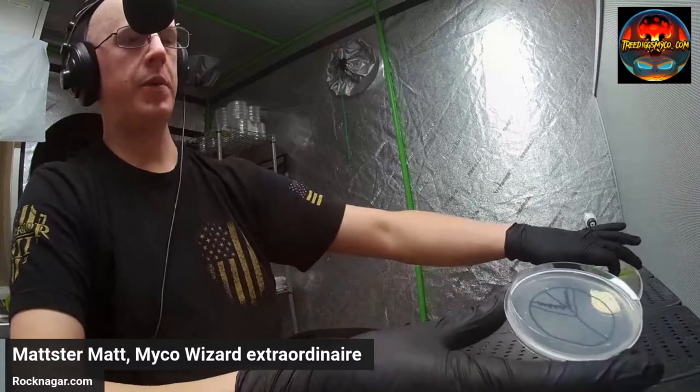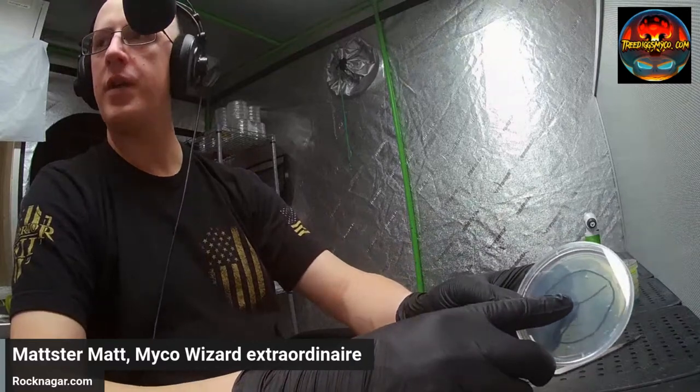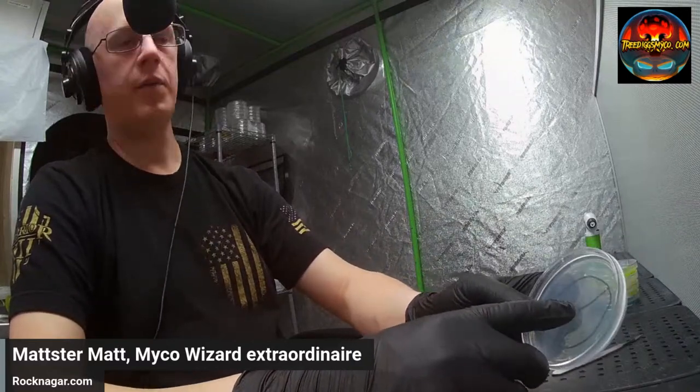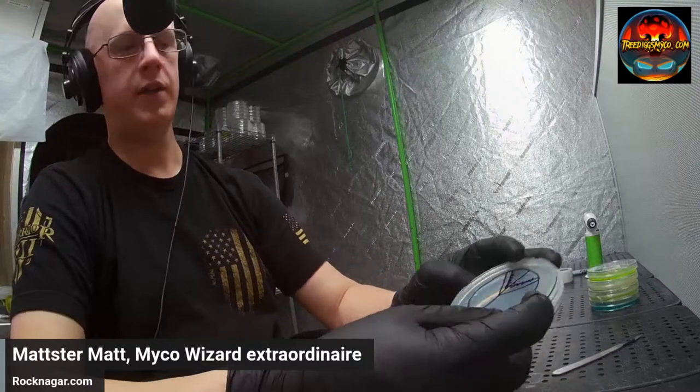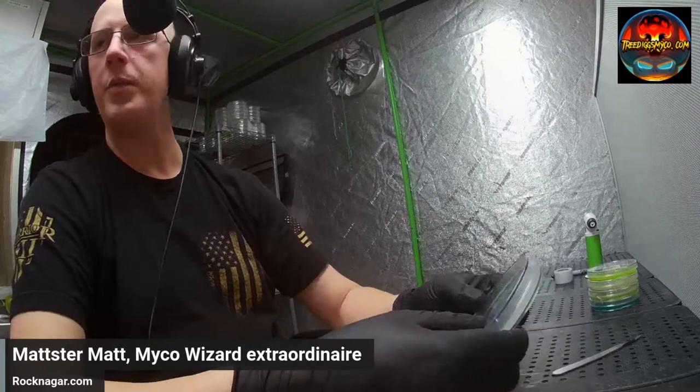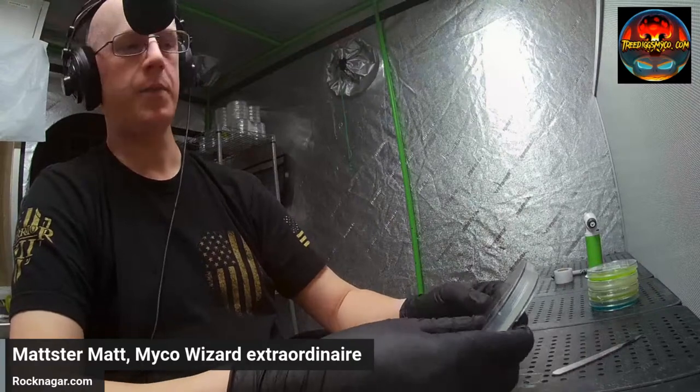But you can just trace the line. And so what will happen now is I'll close this plate up, and I will then put a transfer on here later on. And what will happen is the mycelium will grow across those lines, and those lines that I've cut will show through as being white, like a design, like I had actually cut something out.